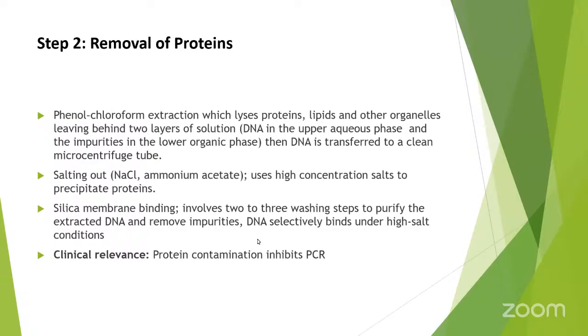Step 2 is the removal of proteins. In phenol-chloroform extraction, the chemical lyses proteins, lipids, and other organelles, leaving behind two layers of solution: DNA in the upper aqueous phase and the impurities in the lower organic phase. And then the DNA is transferred to a clean microcentrifuge tube.